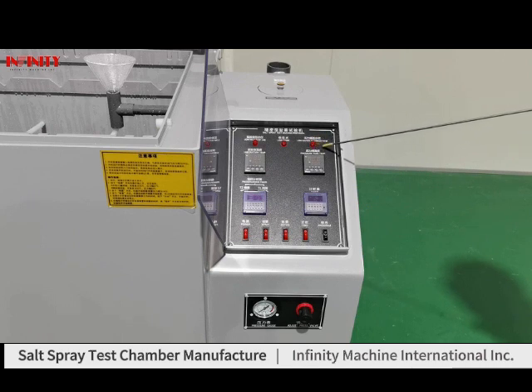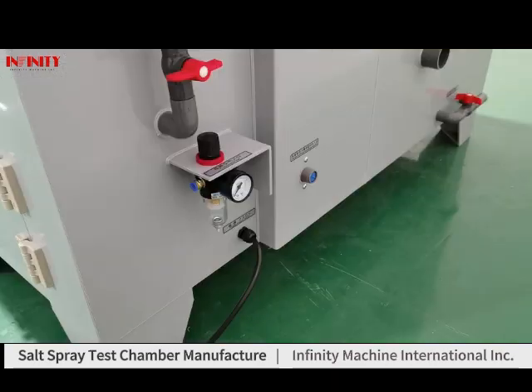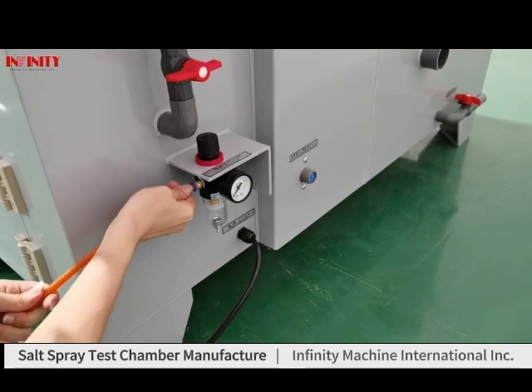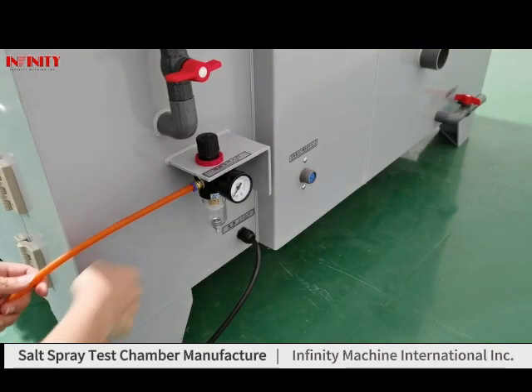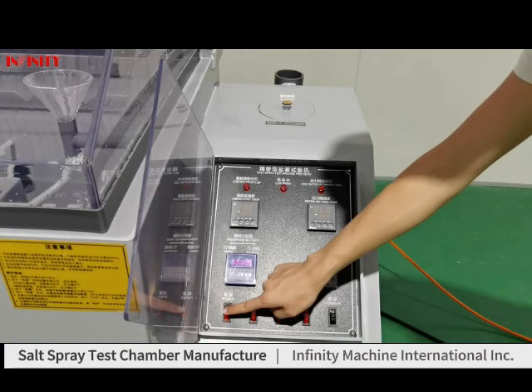There are indicators for low water of the brine test tank, low brine level, and low water level. And this is for the brine inlet. Please connect the compressed air. After that, please connect the power supply and turn the switch on the machine.